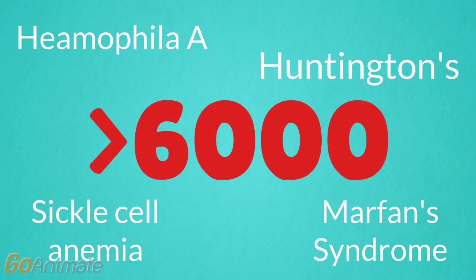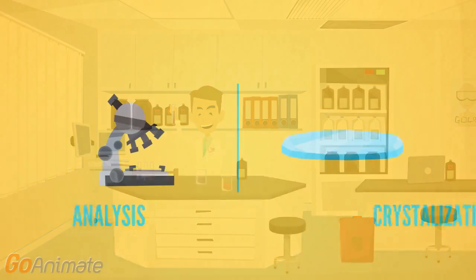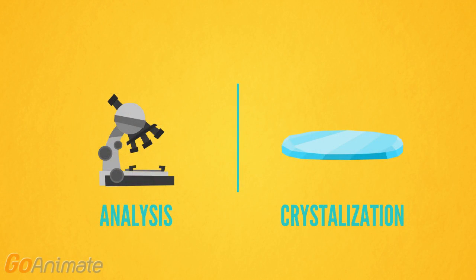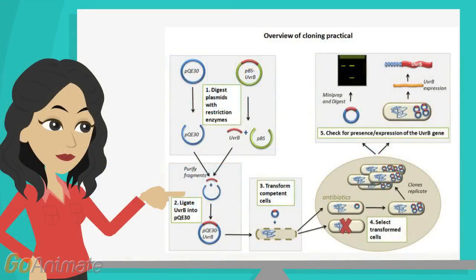While it has clinical significance, gene cloning is very important in the biochemist's lab. We often need large amounts of protein for analysis and crystallization. This practical will teach you the fundamentals of gene cloning, so it's important to keep in mind its many uses.